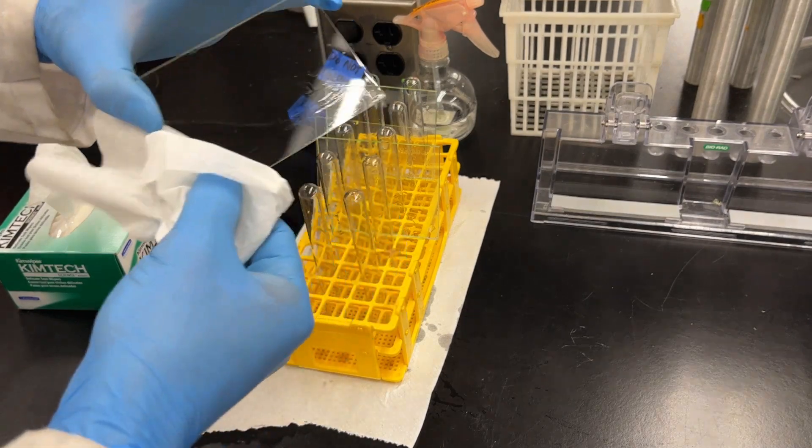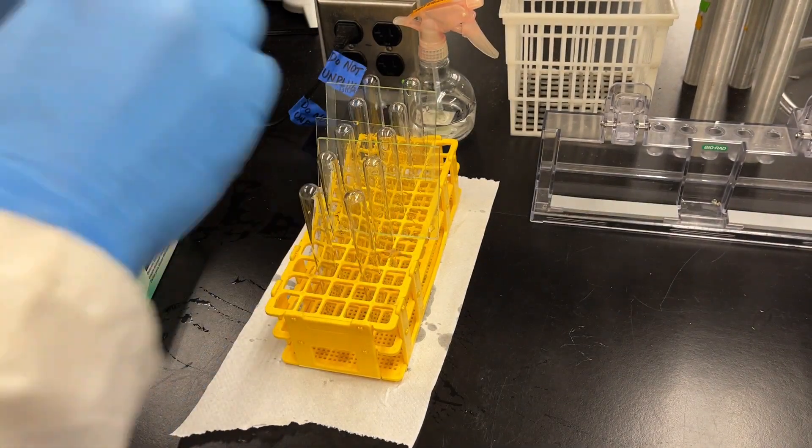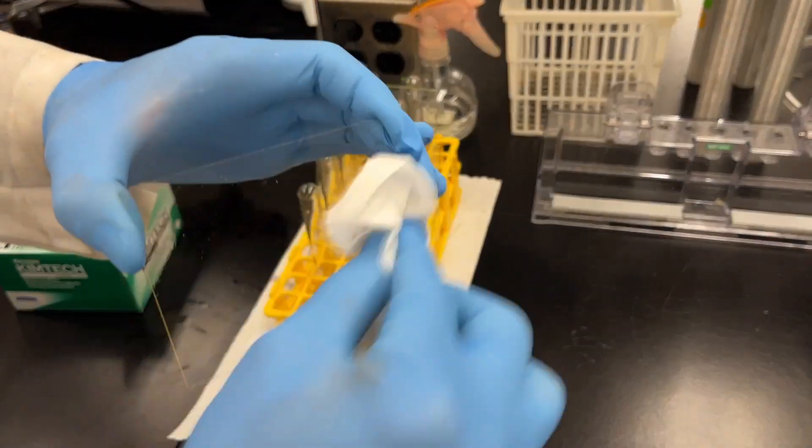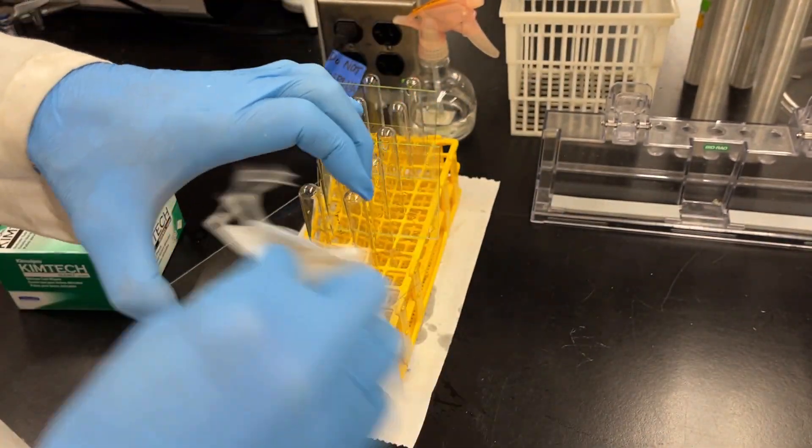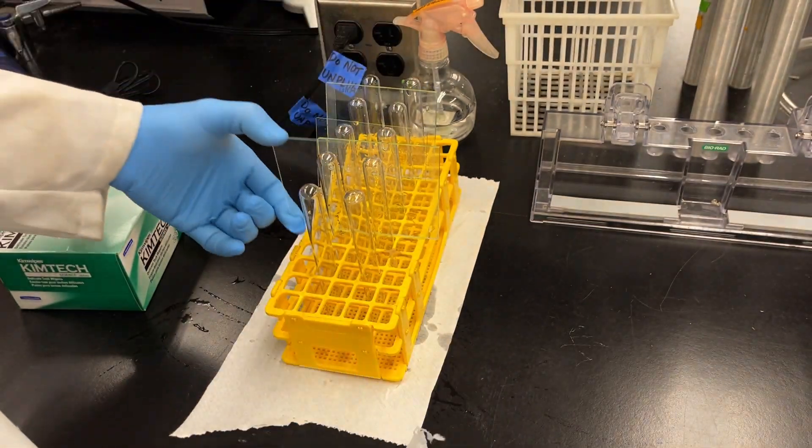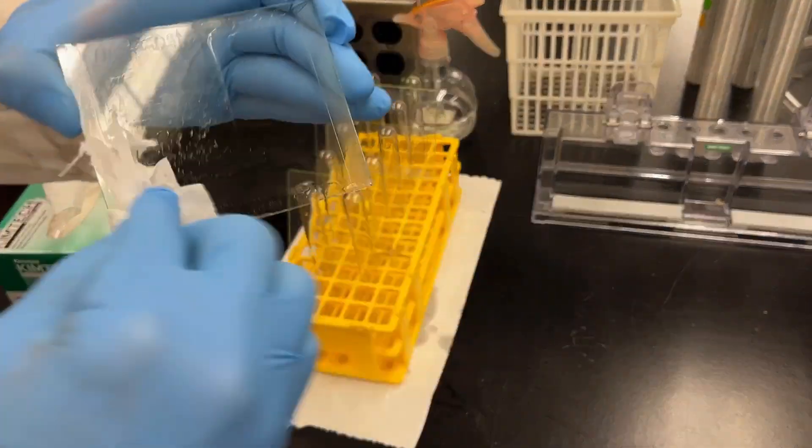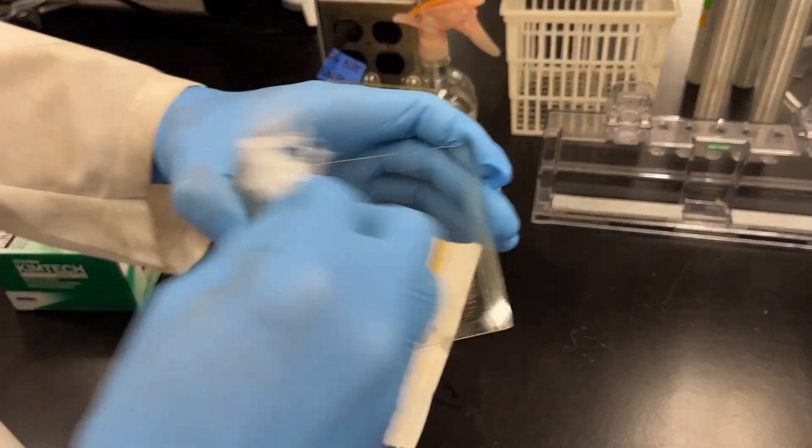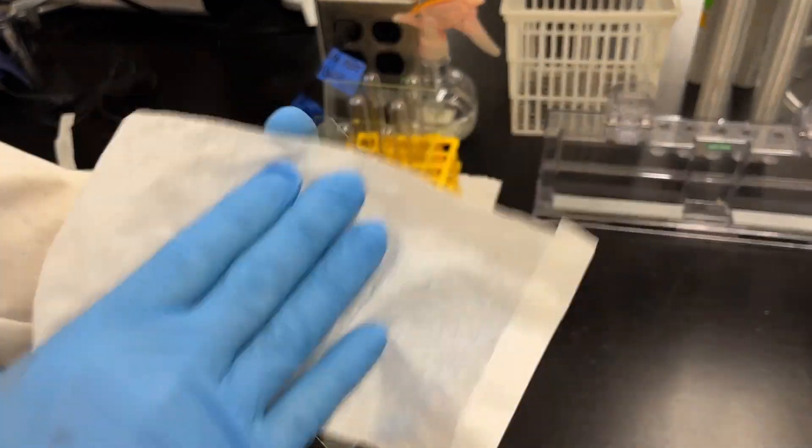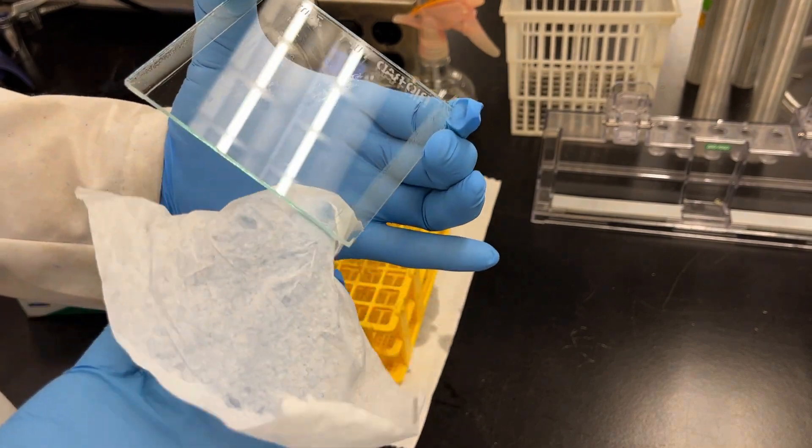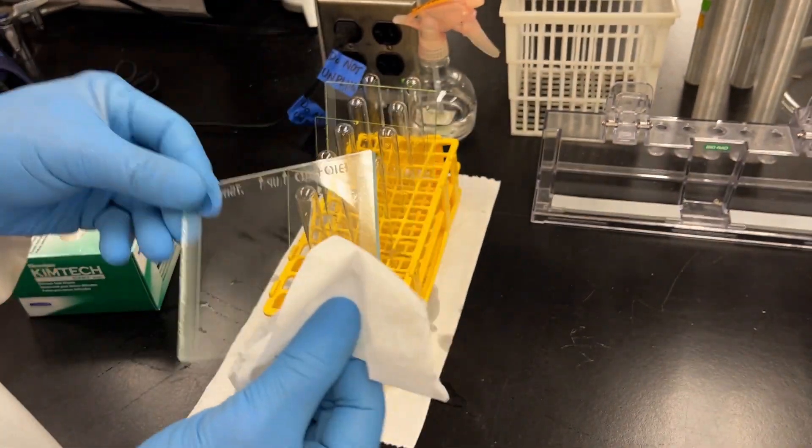Once you're done with the cleaning, dry the glass plates using Kim wipes. You want to make sure that there's no lint left behind or anything like that. Usually you'll find there are some streaks initially after the first dry, but then you dry it again and those disappear. I'm going to pour two gels, so dry all four - two thick ones and two short ones.